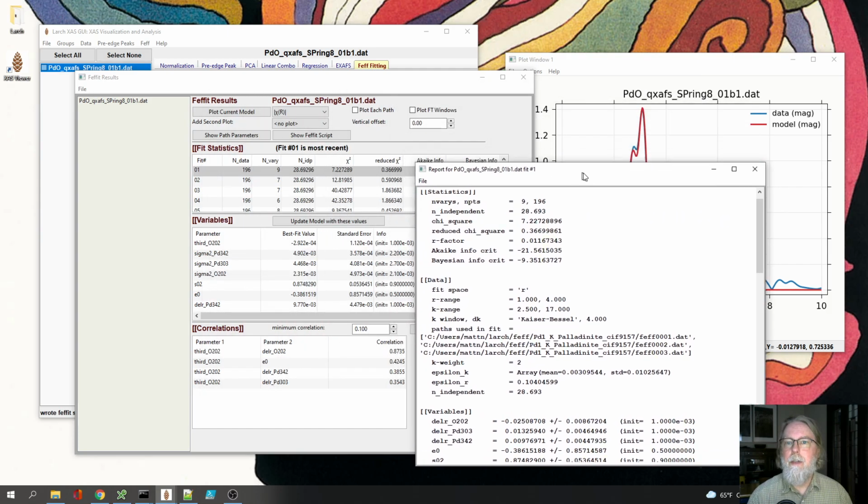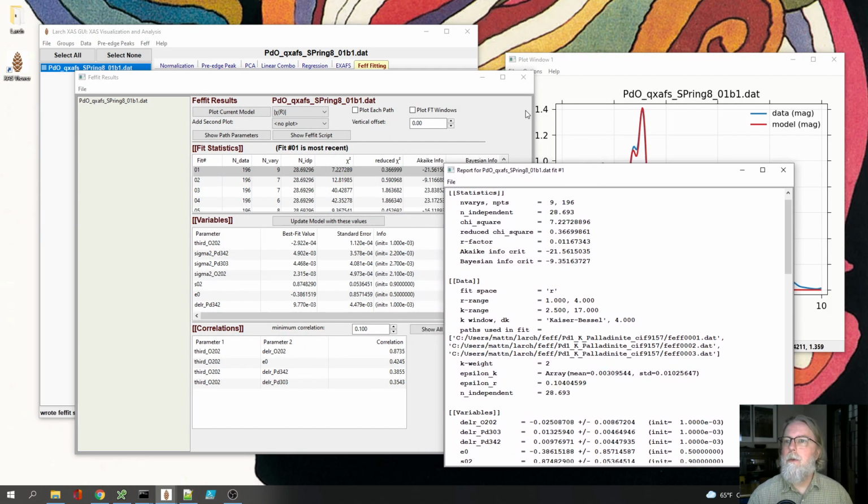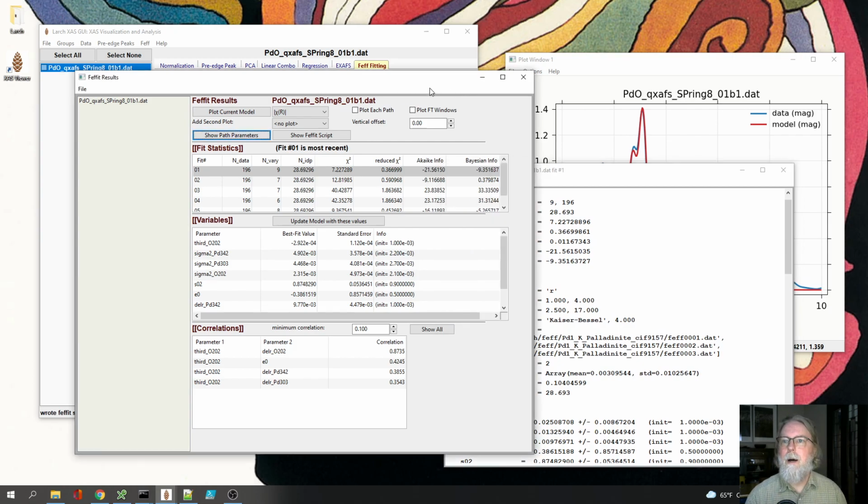Here, this is the case where it does improve the fit to include the third cumulant. So that's often a good thing to test. It's simple to do. So you're almost remiss if you don't try it. And hopefully someone will catch you at that, and say, you should really try the third cumulant and see if that might change the values for your fit.